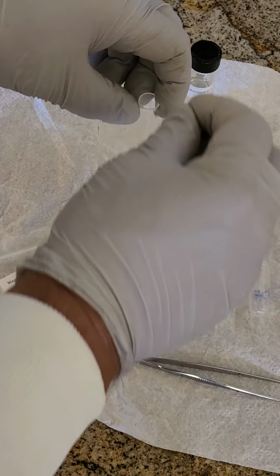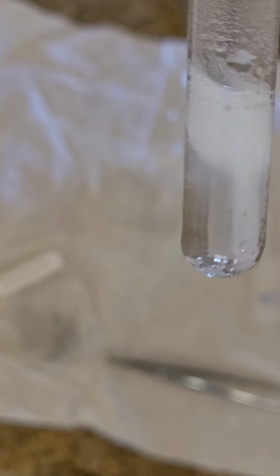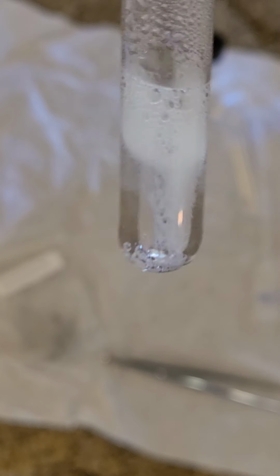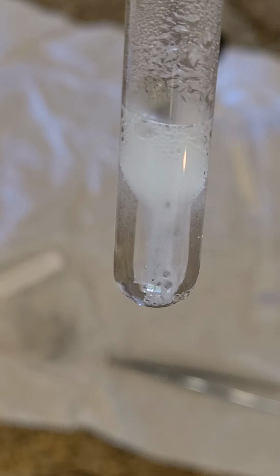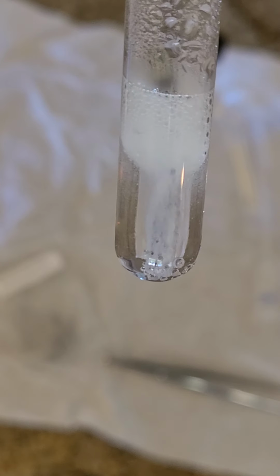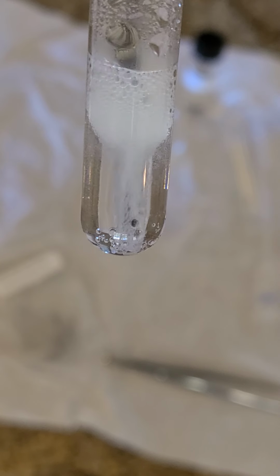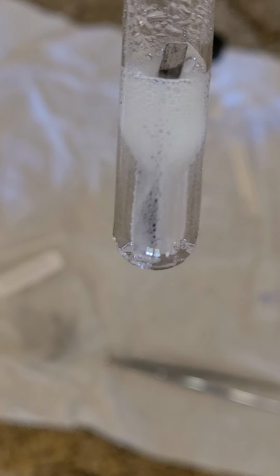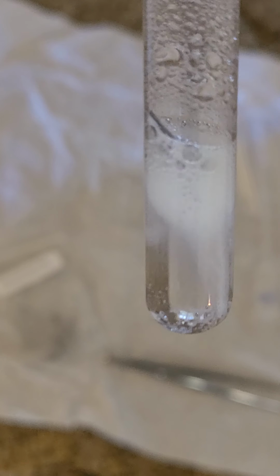The next thing you're going to do is drop in your magnesium, and then you're going to make an observation and categorize this reaction. Another reaction we could have done with the magnesium was burn it, but that emits a really bright light. This is a different reaction. It's really neat. We've learned this particular reaction where you add a metal to an acid, and what does it look like we're producing here? The bubbles are an indicator of what? A gas. So this is producing hydrogen gas because magnesium is displacing the hydrogen in the hydrochloric acid so that it can dissolve in solution. If you leave this long enough, the magnesium ribbon will completely dissolve, unless the hydrochloric acid is a limiting reactant and there's not enough of it to dissolve the magnesium.